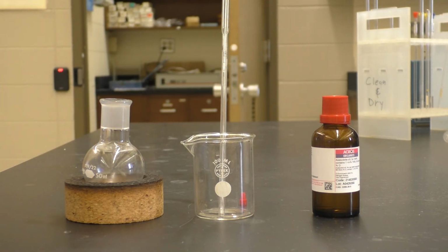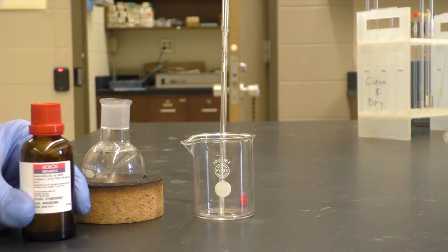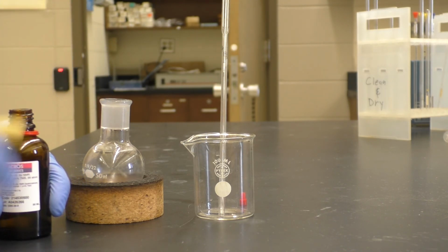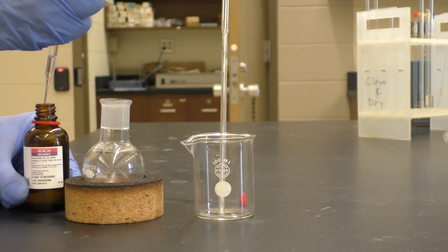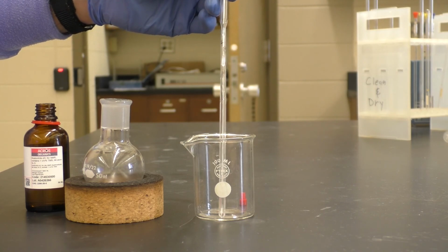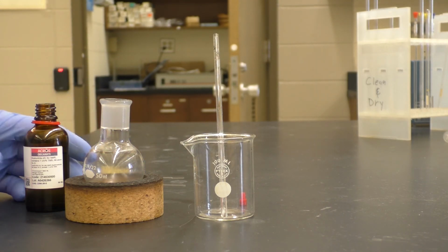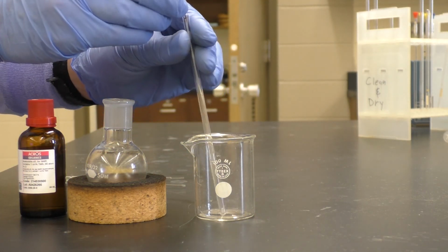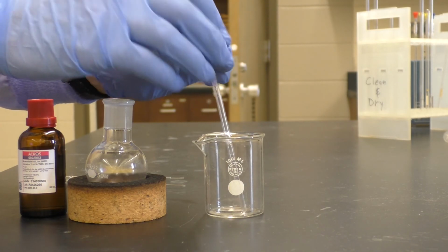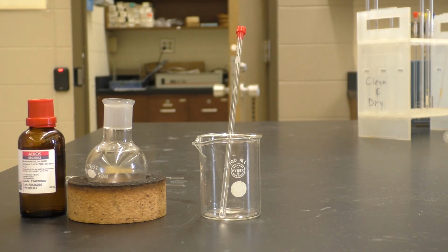From there, I'll take some NMR solvent. In this case, we are using deuterated acetonitrile rather than deuterated chloroform, but I could use deuterated chloroform as well. And I'll add that down through the pipette to wash the solution down in. Simply then remove the pipette. Cap my NMR solvent, cap the NMR tube, and I'm all set at this point to take the sample to the NMR room for final analysis.